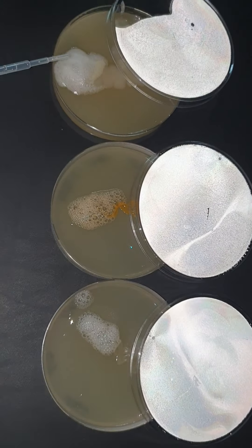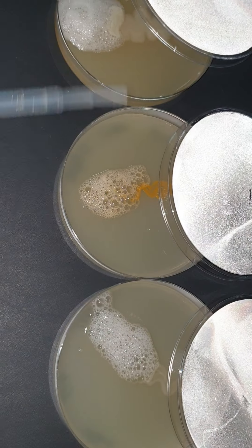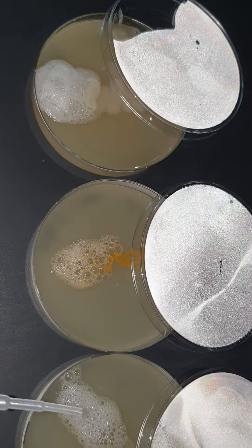But on the colonies of Bacillus, Staphylococcus, and E. coli, I can see bubbles, which means that those bacteria produce catalase on their own and they are breaking down the H2O2 into water and oxygen. See the bubble formation? These are bubbles of oxygen. Therefore, our three bacterial cultures are catalase positive and they are positive for aerobic respiration.